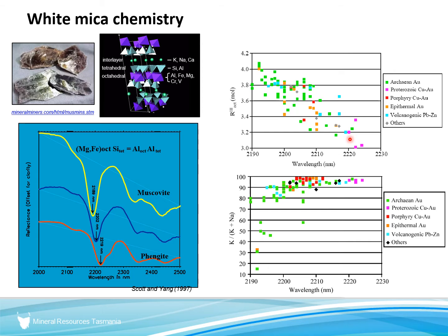If you have 5 samples which are increasing, going from muscovite to phengite, and you did the spectral analysis of them, they might not do anything sensible. But if you had 50,000 samples where there was a trend in one drill hole, or a number of drill holes, then you would see that, just because the sampling is completely oversampled, and the calibration statistics like this just pale compared with the trends that you see.